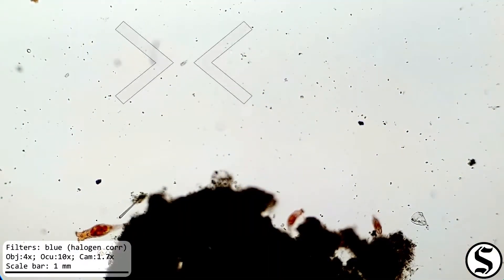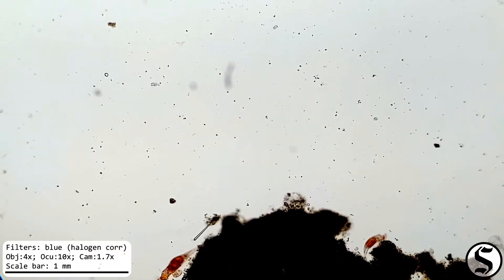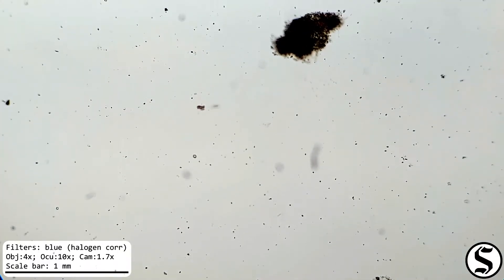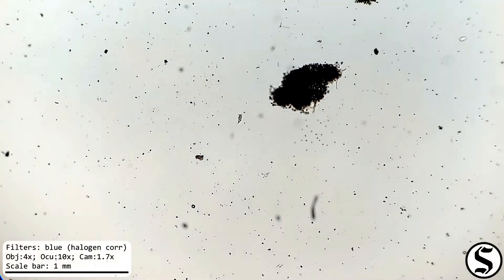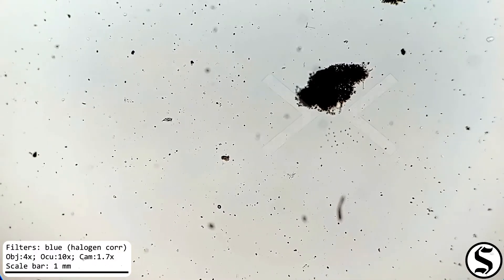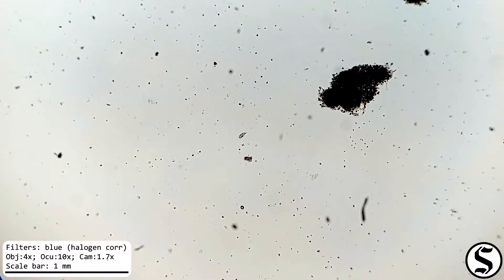And that looks like Opercularia swimming around. I'm curious if they intentionally went out looking for better conditions, or if they had set up shop on the algae like that one there did, and the algae just ended up being so loose that when I scooped it up, they were disturbed from their fixed positions.